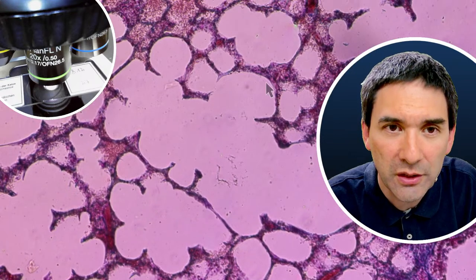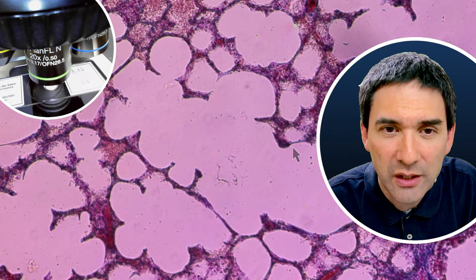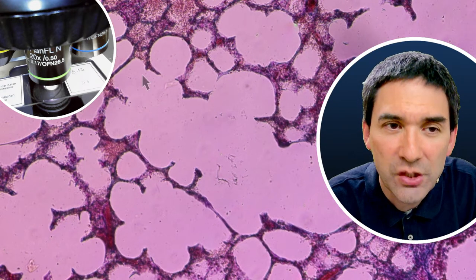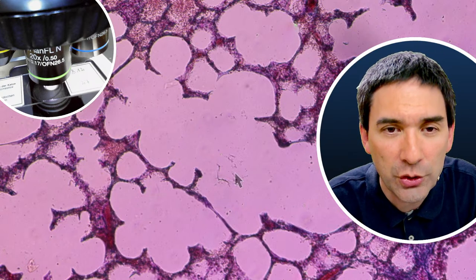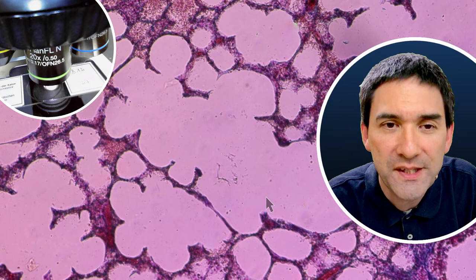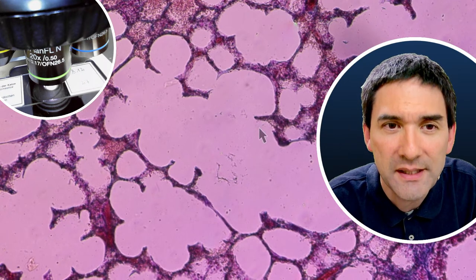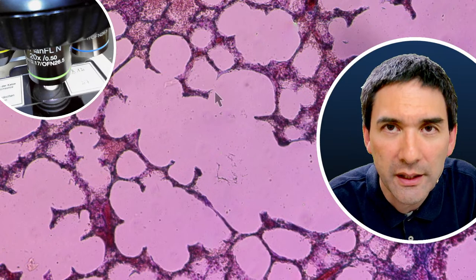This is because it was cut too thin, it was removed, but essentially then you have those air sacs, the alveoli, joining together, and this reduces the surface area to the extent that gas exchange cannot happen anymore. So damaged lungs of emphysema would have basically much larger alveoli. And this, of course, significantly reduces the ability to take up oxygen.